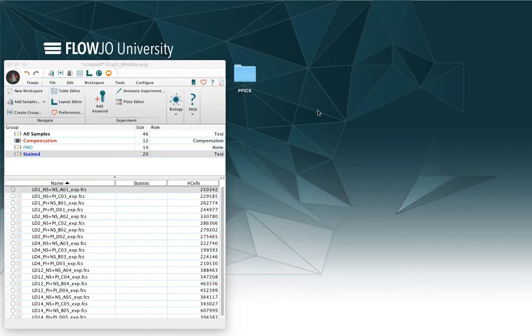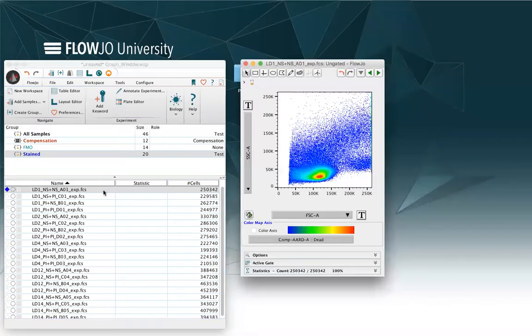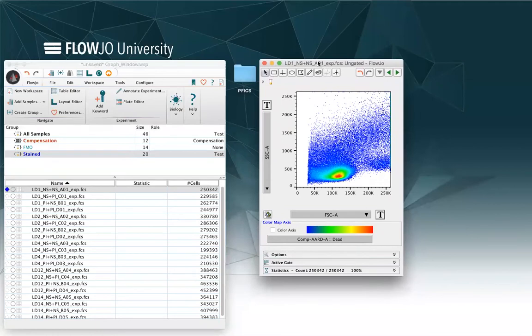If I want to open up a graph window, I will just double click on a sample. When a graph window opens up, I will have the information of the name of the sample and the gate just on top of it.